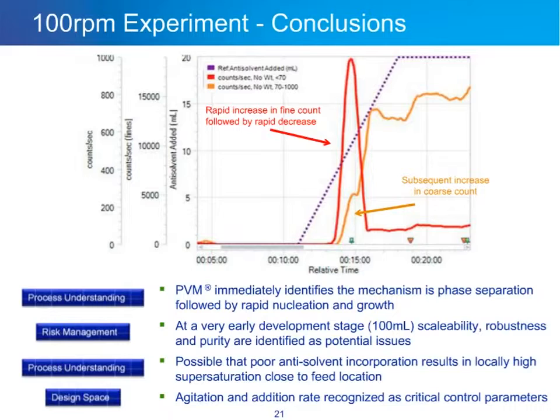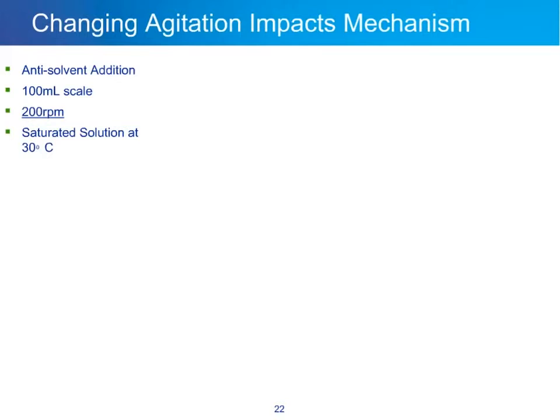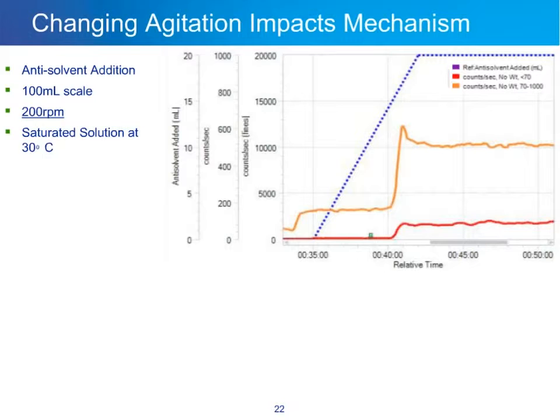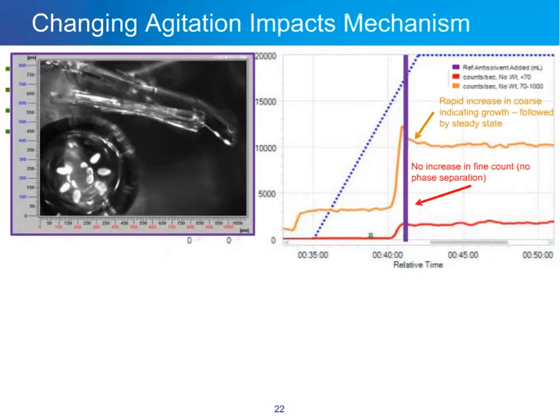We now repeat the exact same experiment but with agitation at 200 RPM. The FBRM trend is very different: we don't see that rapid increase and decrease in fine count, indicating no phase separation or oiling out. Instead, we see a rapid increase in the coarse count, indicating extremely fast growth that reaches steady state very quickly. Taking a PVM image at the point where we previously saw oiling out, we see simply nice, long, well-formed crystals with less agglomeration.